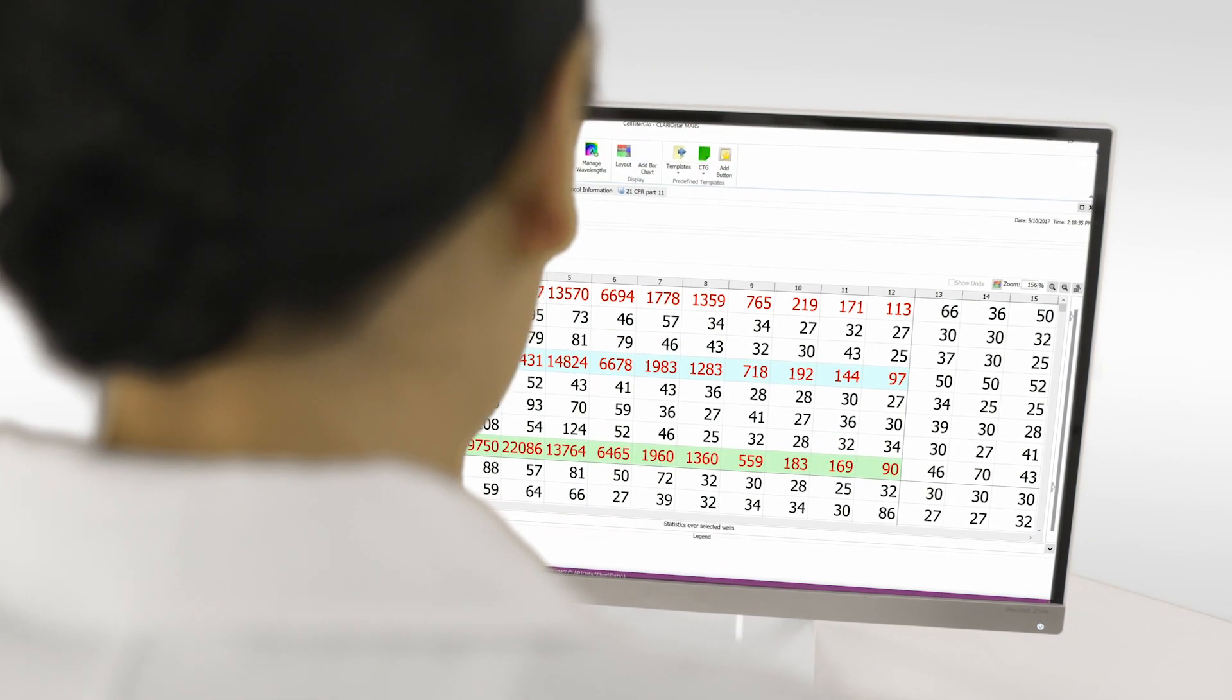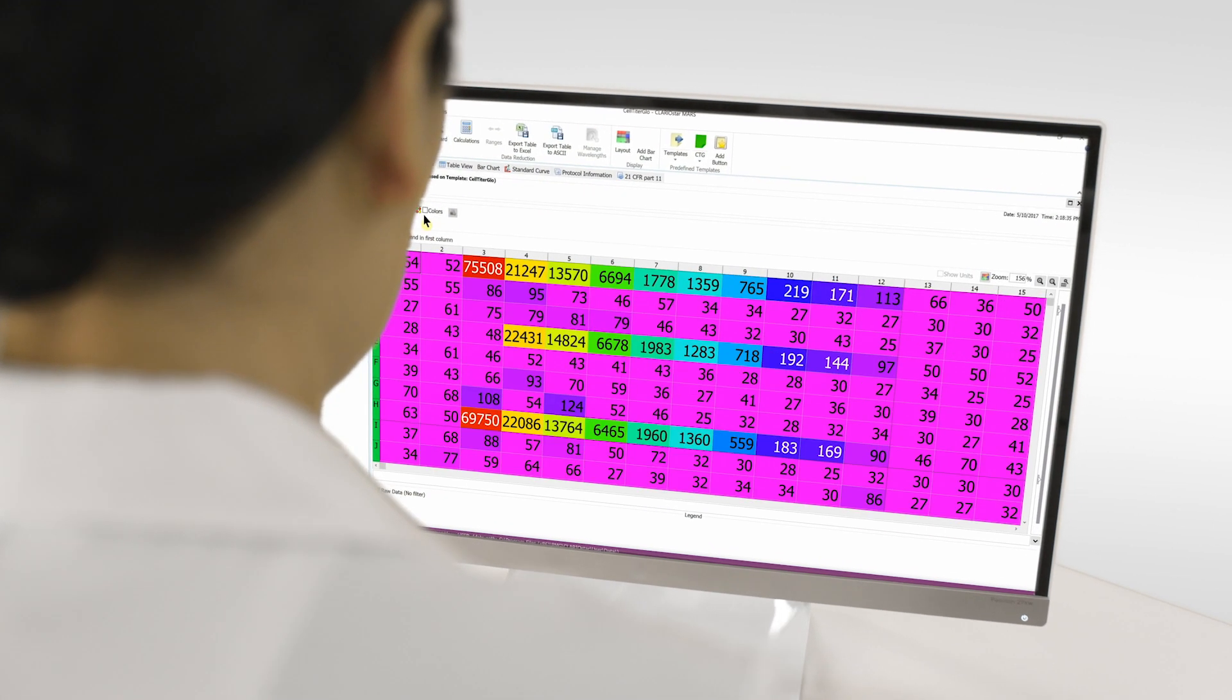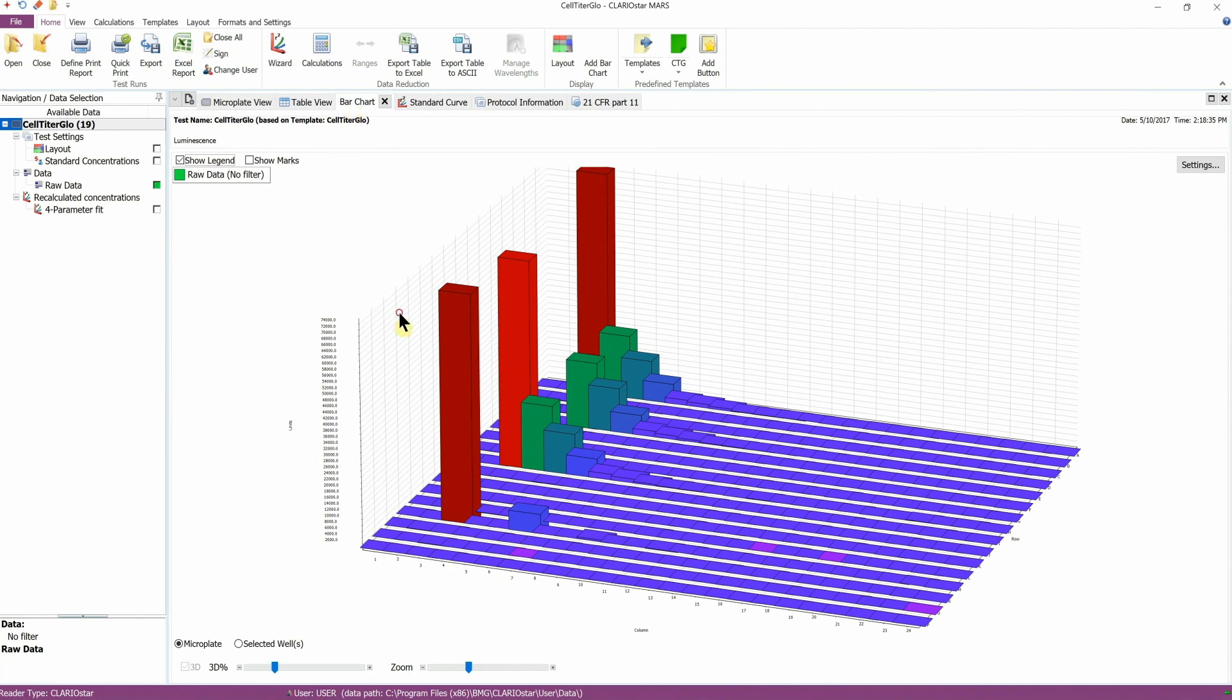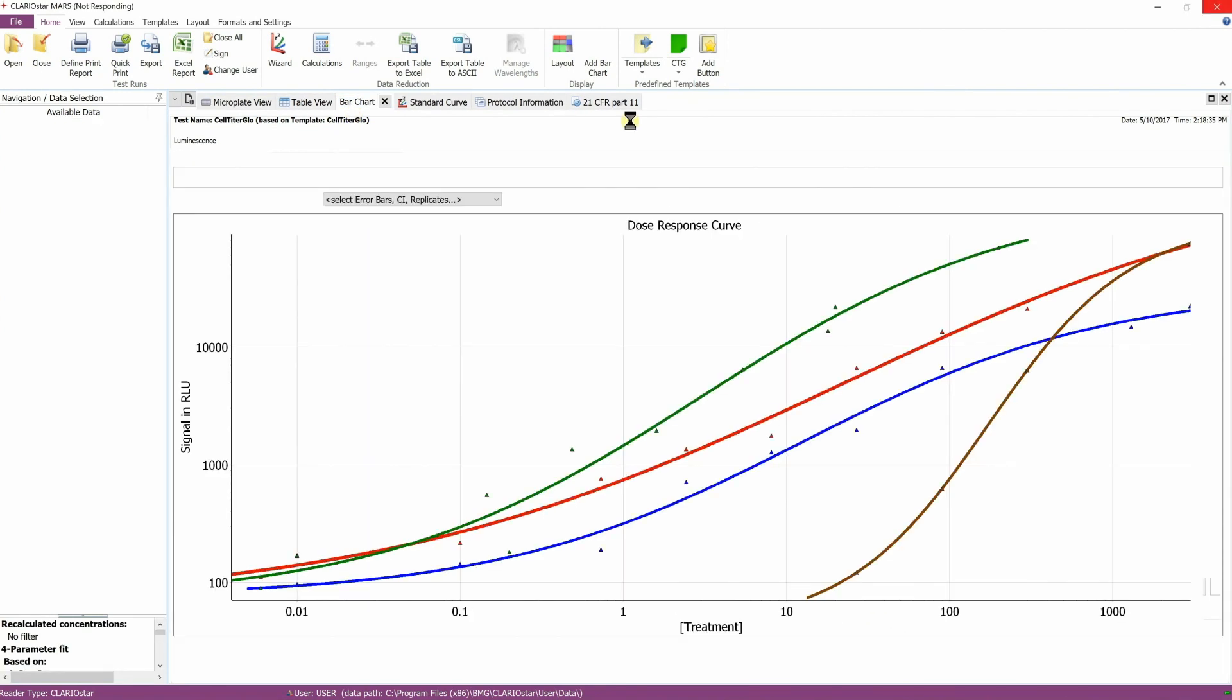BMG LabTech offers a unique and intuitive data analysis software, MARS, that allows users to easily perform a variety of data reductions and complex mathematical calculations critical to life science research.